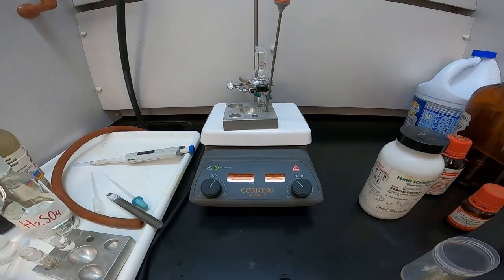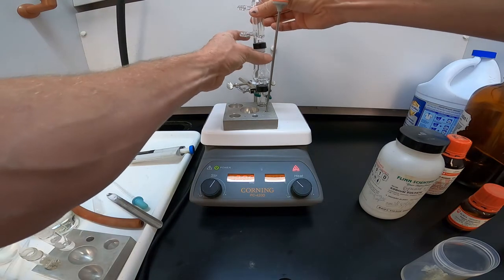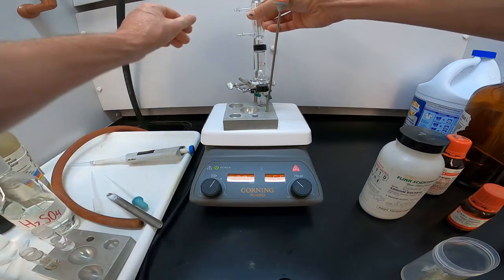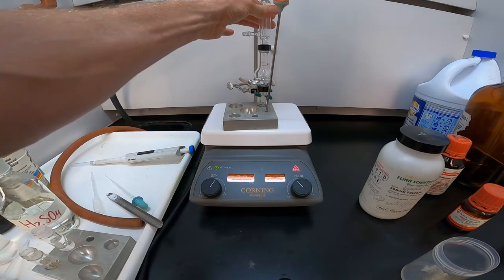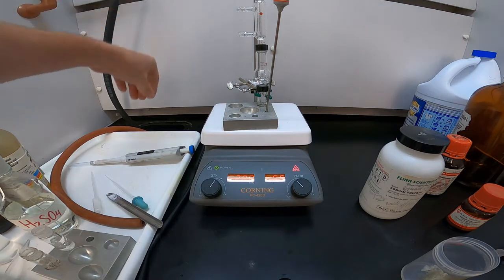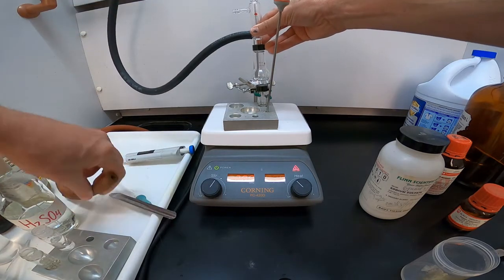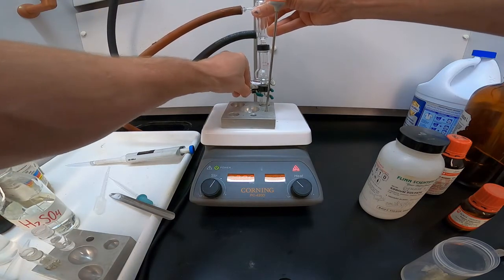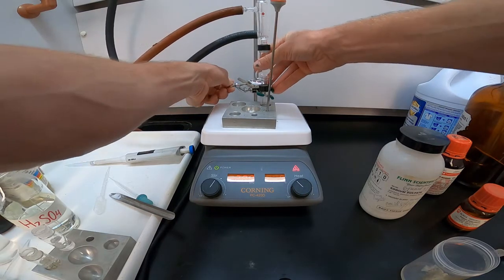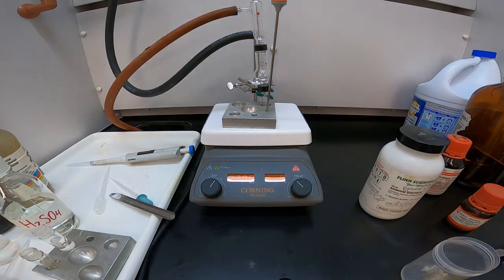And since we're heating it at a pretty high temperature, we want all of our organic product to recollect into the distillation flask. So to help with that, I'm going to put the reflux condenser back in. We don't need the calcium chloride drying tube. And I'll set the reflux condenser back in. So now what this will do is allow any product vapors that go too far up in there to recondense back down and collect in the curved part of the Hickman distillation head. So I'll come back in a minute and I'll explain and show the product collection.